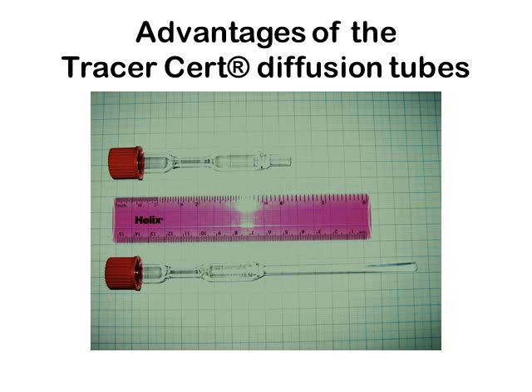Sometimes, instead of directly using a compound to generate its vapour, we can use a compound that, when heated, decomposes to the vapour of interest. For example, metaldehyde, which decomposes to the original monomer acetaldehyde, or paraformaldehyde, which decomposes to formaldehyde when heated in a dry gas flow.